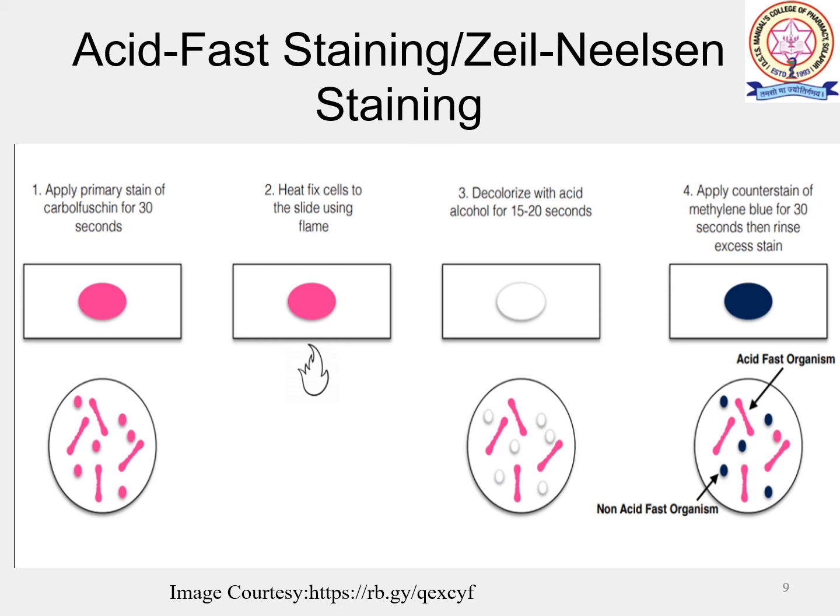The procedure involves, as the first step, the preparation of the smear, which will be repeated as before, and then that smear will be placed on the slide and fixed. Then you have to put the carbol fuchsin and keep a filter paper over it, and this will be placed on the water bath, and above that water bath you have to keep a mesh like structure, and on that mesh you will keep this slide.